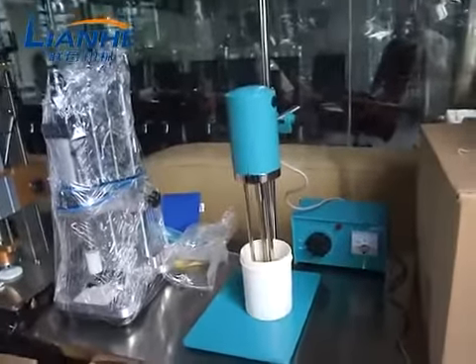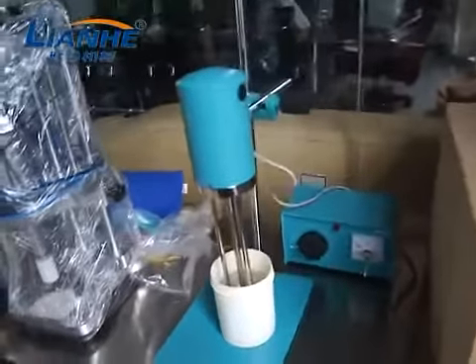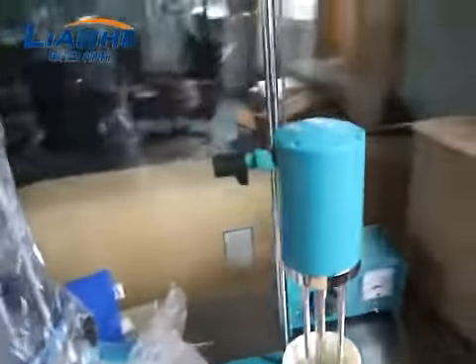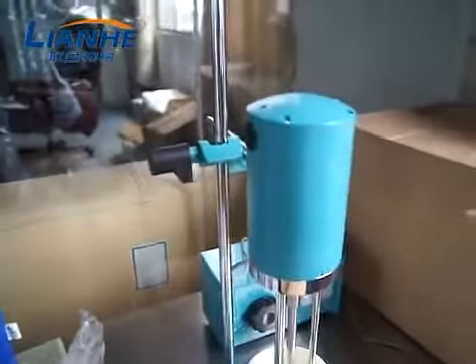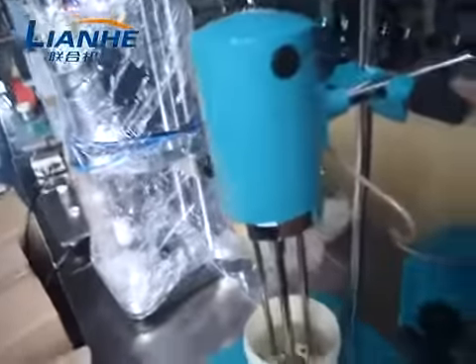And now we are going to test this lap homogenizer. You can adjust the height of the homogenizer in this part, and the position of this homogenizer in this part.